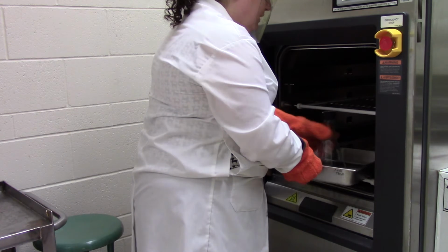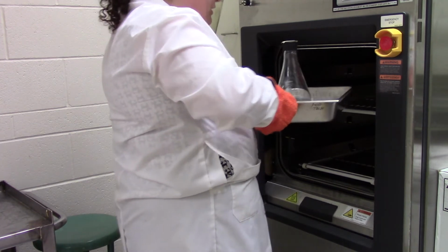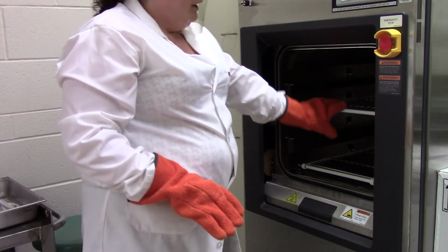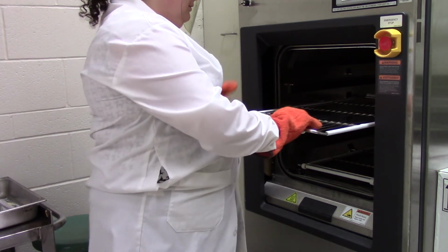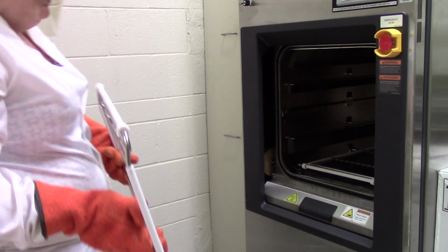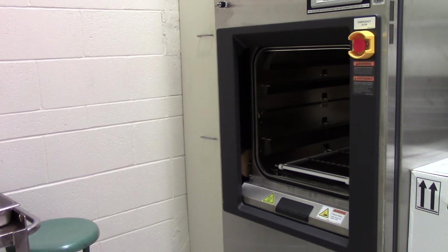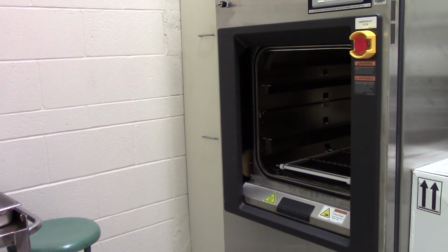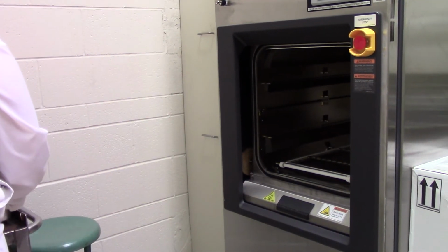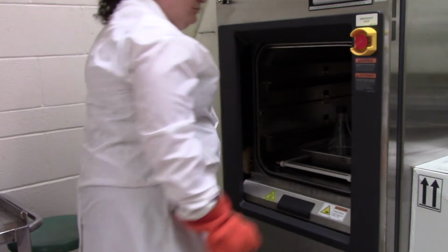You can see here this one won't quite fit, so we can actually, I'm not sure if that's fit. Yep, so this is another good reason to wear the heat-resistant gloves. There are extra racks in here and sometimes you don't need them, so you bring them out very carefully. And we've actually got a bit of a rubber mat on the floor over here, so I'm going to set it off to the side there just so it can cool. Now I can load my materials. And close the door.